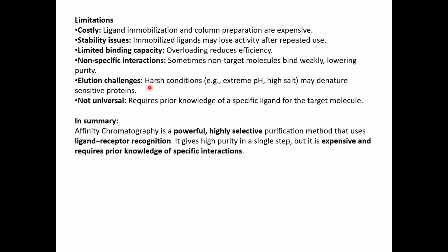So, in case downstream you're planning to do some other experiments with the protein, if you want to do an activity assay, or if you want to characterize the protein structures, then you have to be extremely careful about which conditions can be altered for that specific protein, so that you don't lose the protein's characteristics or denature or degrade the protein by changing such conditions.